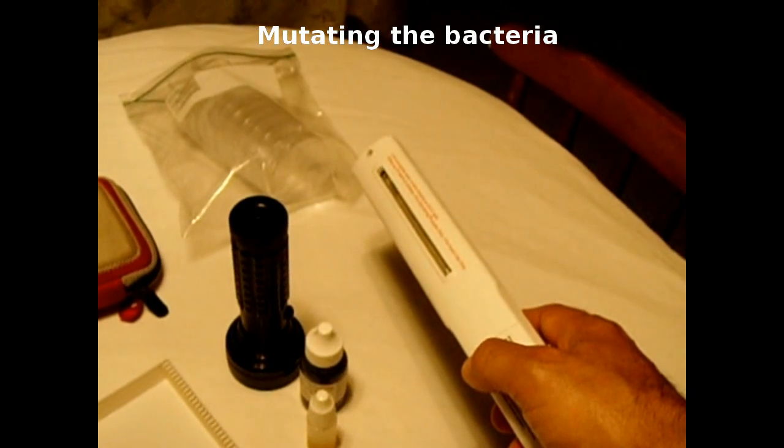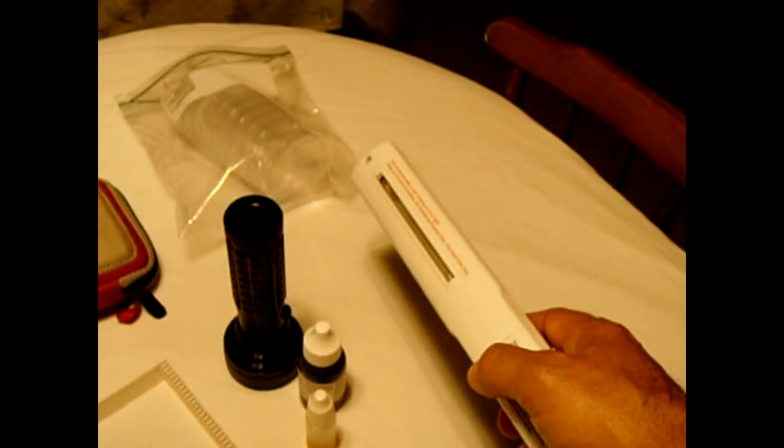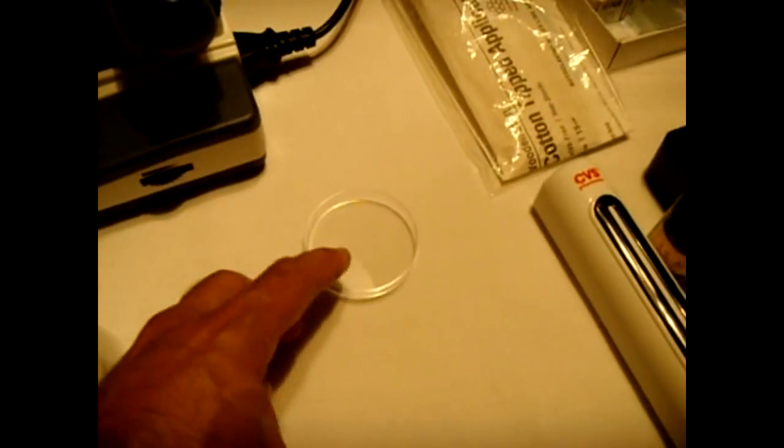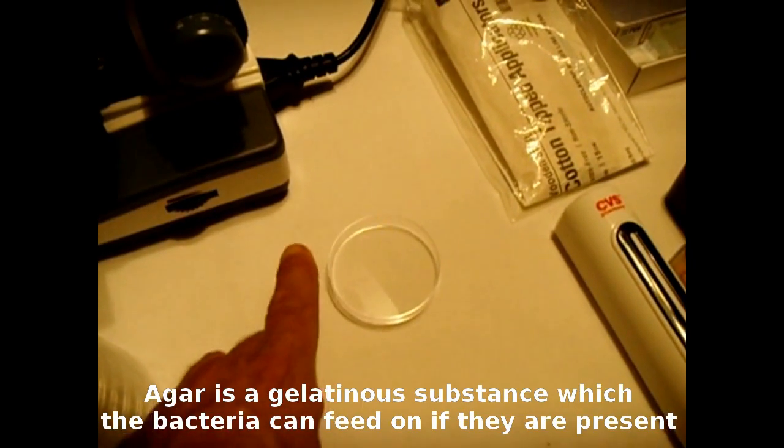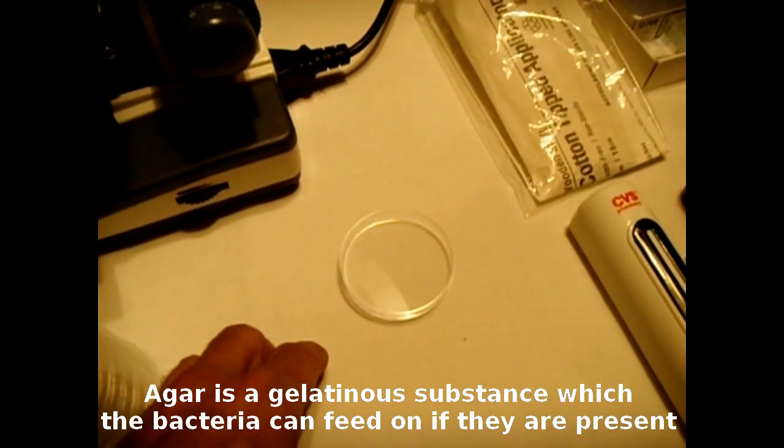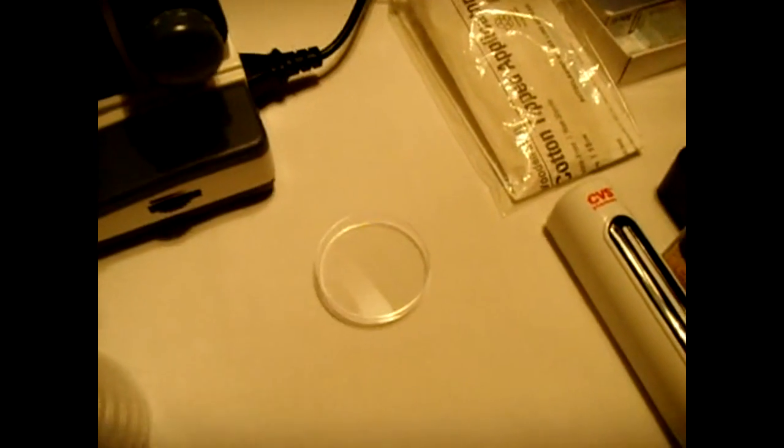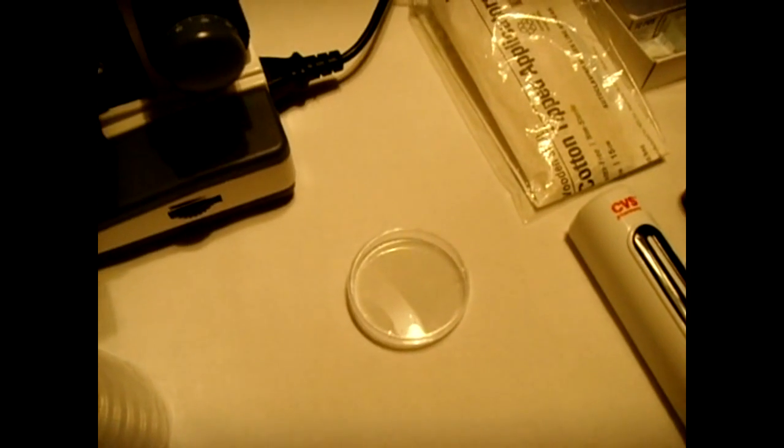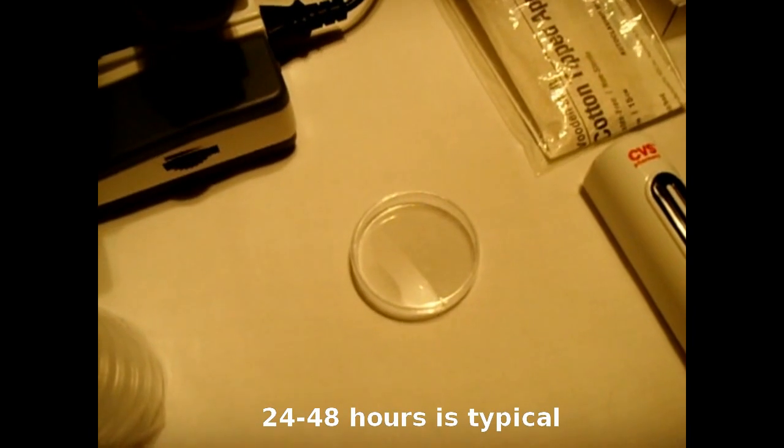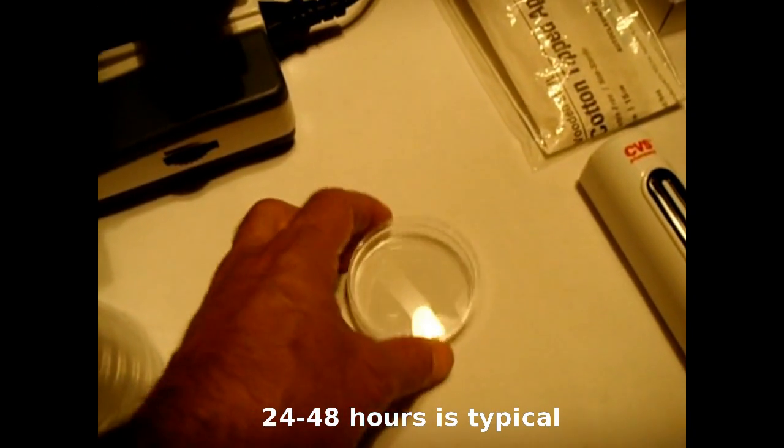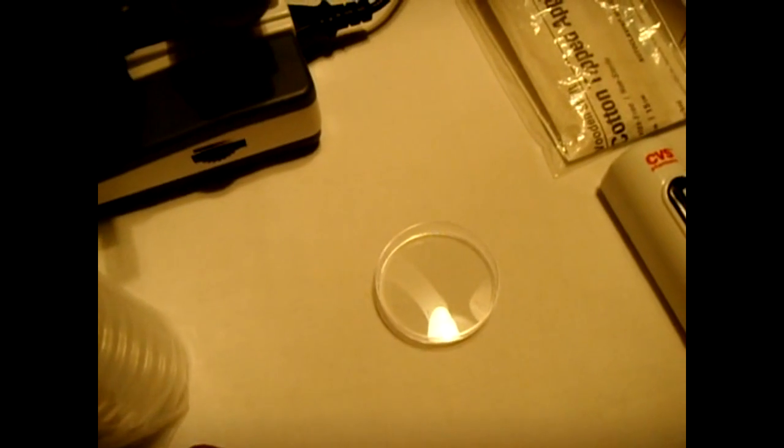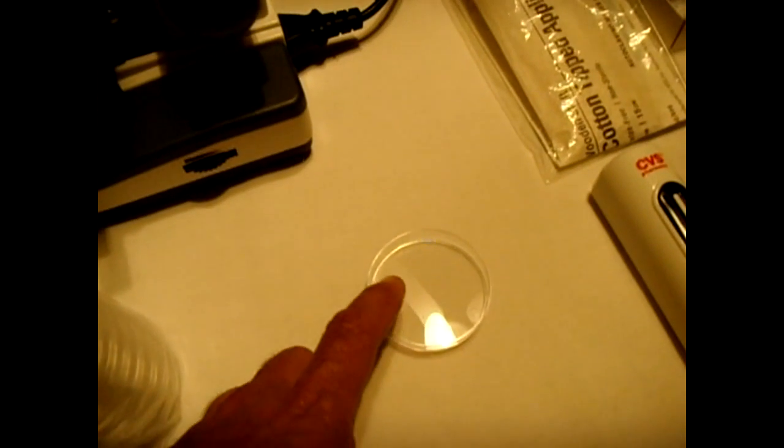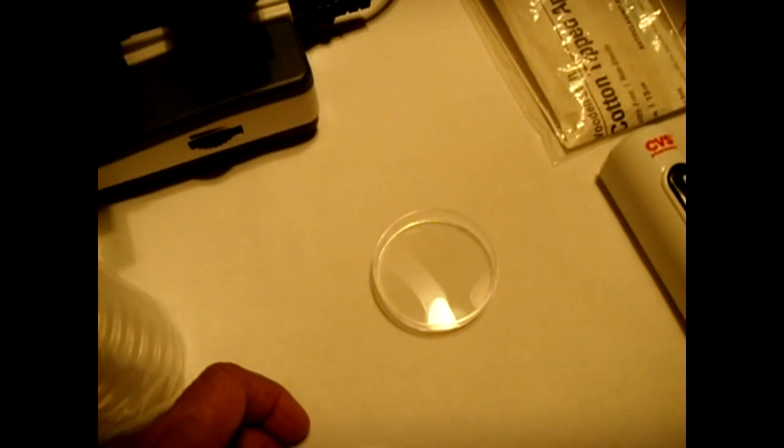Now the only way to confirm that the bacteria has been damaged and it will not multiply further from the use of the UV light would be to do a culture. You'd have to mix up the agar and then do a swab. You would take the bacteria that was exposed to the UV light, apply it to the agar, put the cover back on, then place this culture in an incubator for up to 24 hours. After being in the incubator for 24 hours, you would take a look at the agar where you brushed on the bacteria which you supposedly deactivated with your UVC light, and you shouldn't see any colonies growing on top of the agar.